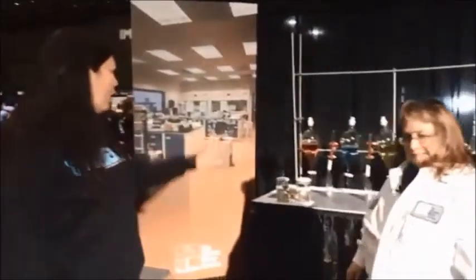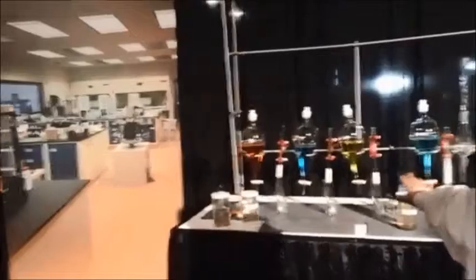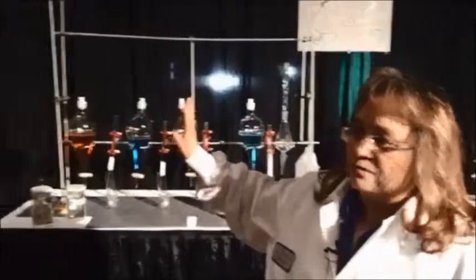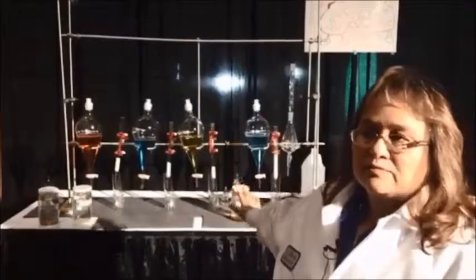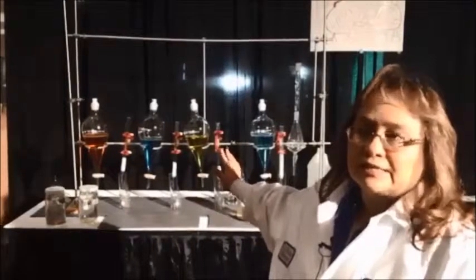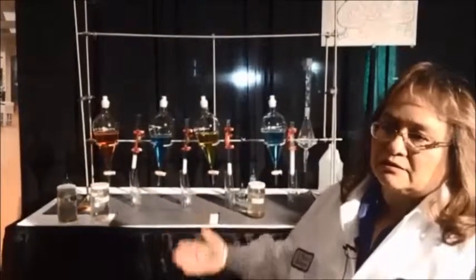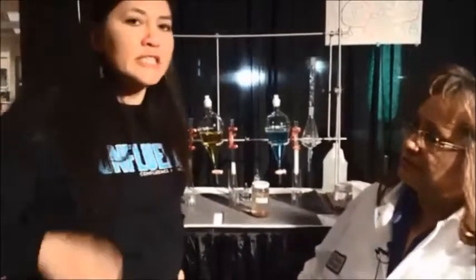Now, right behind you, and be careful with the cord here, I don't want you to trip, but behind you, you have a very visual, colorful setup here. You want to talk about that? This is, if you look at the picture over here, this is part of our laboratory, and right here is what we call fats, oil, and greases extractions, and that's, if you're familiar with the grease monster, they bring samples in and we test for the amount of grease or fats that is in that sample, and so those numbers get translated into however much per pound, and so we get an idea of how much is going into the sewer system. Oh yeah.